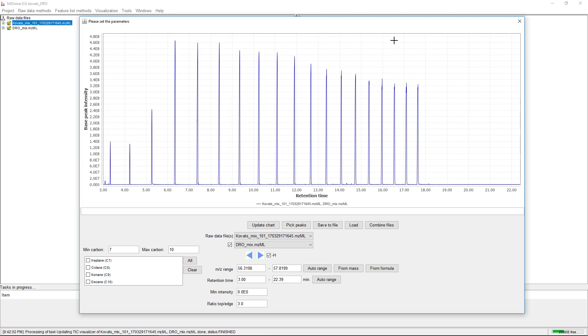On the GNPS web server, we perform spectral matching. We create a spectral network from the GC-MS spectra and then match all the spectra against the spectral library.